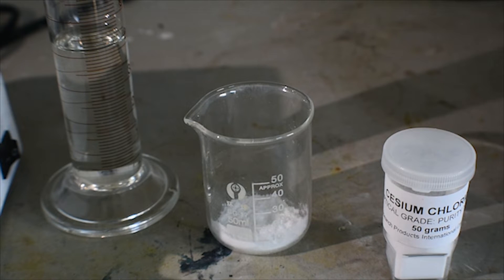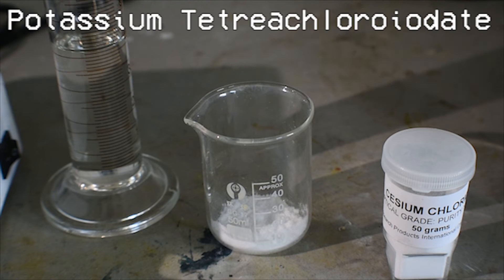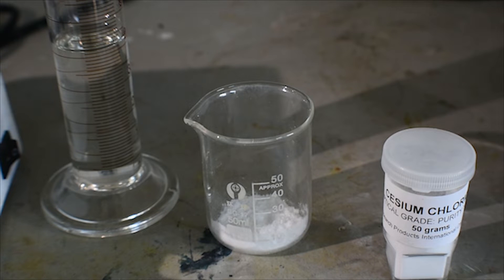First, I'm going to make potassium tetrachloroiodate, formula KICL4, via the reaction of potassium iodate with hydrochloric acid. This will generate chlorine gas in a large quantity, so this must be done outside in good ventilation or in a fume hood.